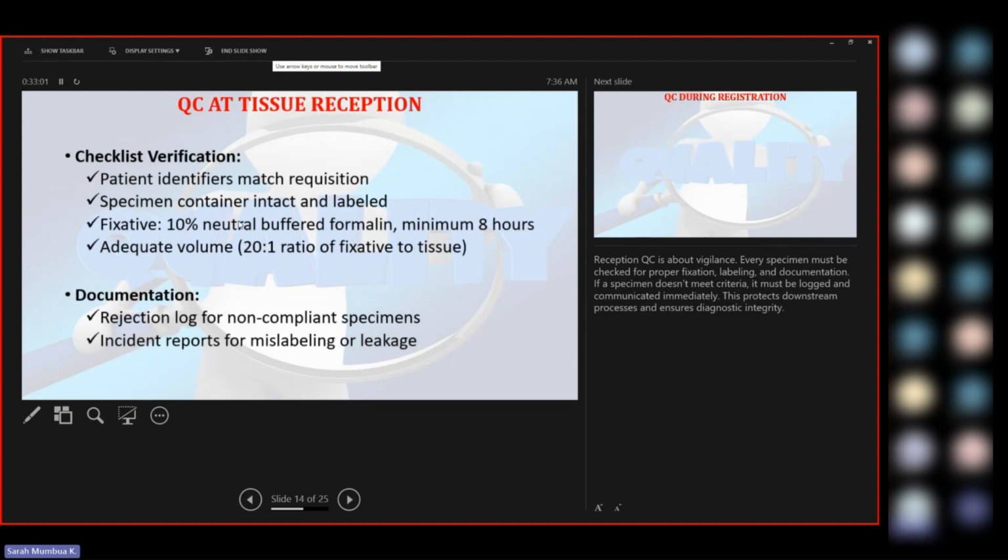And even during our staining, make sure you stain a quality control slide also. Most of the places we use the appendix tissue to make control slides for staining. It stains best with the hematoxylin and the eosin. So once you've taken the appendix tissue, process it normally. Then during staining, you use one slide for staining. Then you see how the slide appears in the microscope.